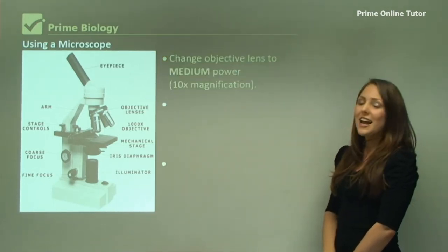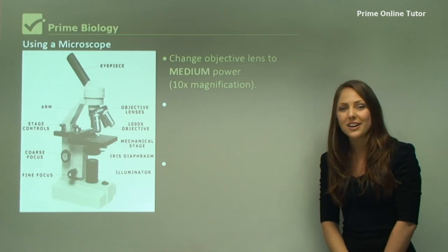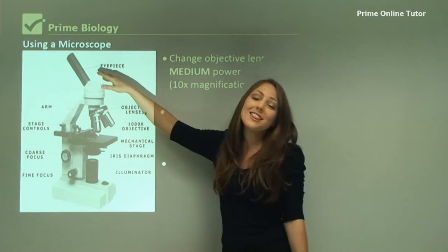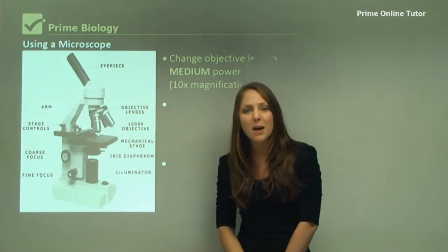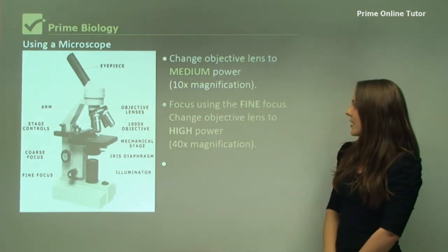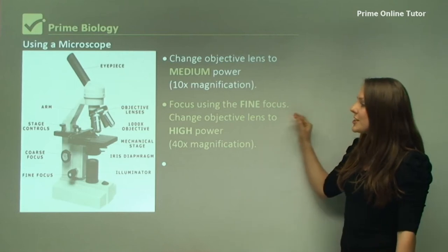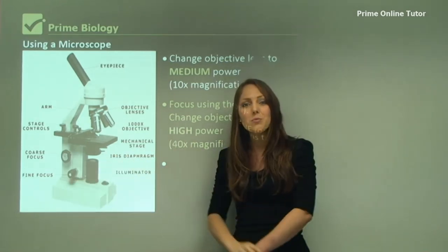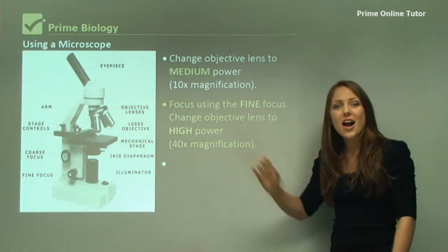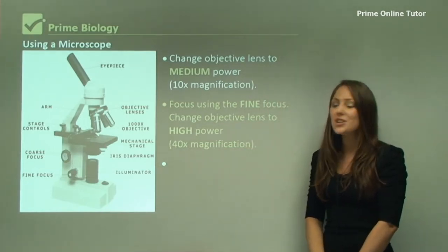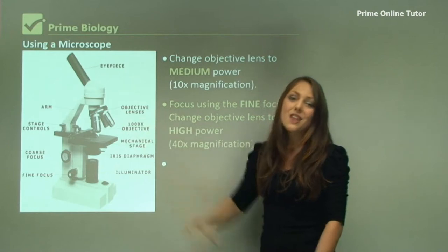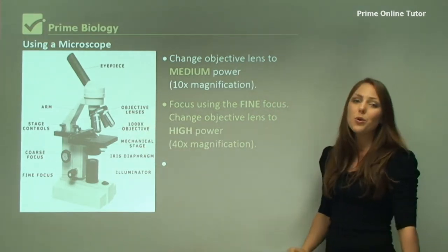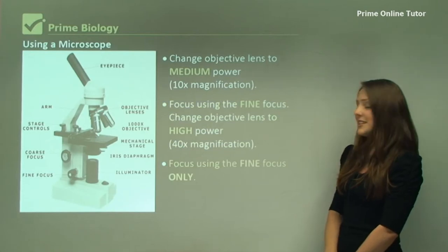You can change the objective to the medium power. The medium power objective is actually 10x magnification. So with the eyepiece, it's 100x magnified. You can then focus using the fine focus. And you can go up to the highest possible power, which is 40x objective lens. The total magnification then is 400x, and you only focus using the fine focus with this one.